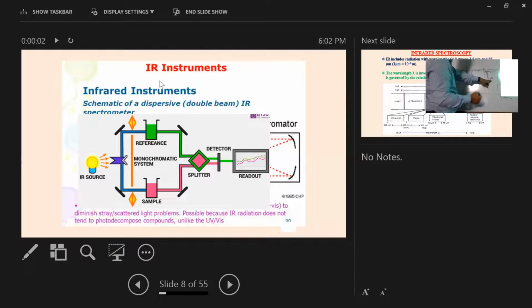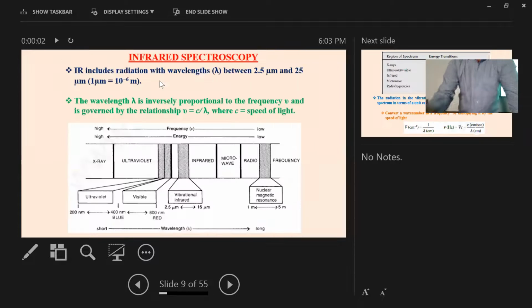If you have this 100 and this is maybe 10, that will give you 100 by 10, so the SN ratio becomes 10. So the first one is better compared to this, in terms of signal to noise ratio. If the instrument has a very good signal to noise ratio, then your instrument is good. And the other way around, the instrument is quite bad.